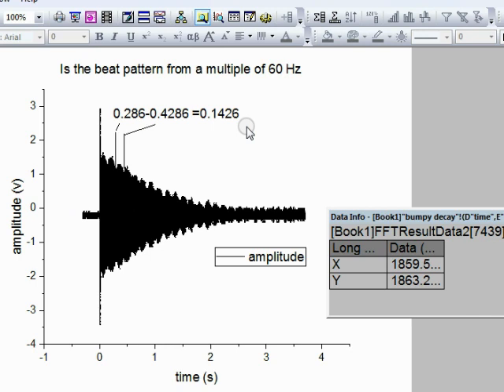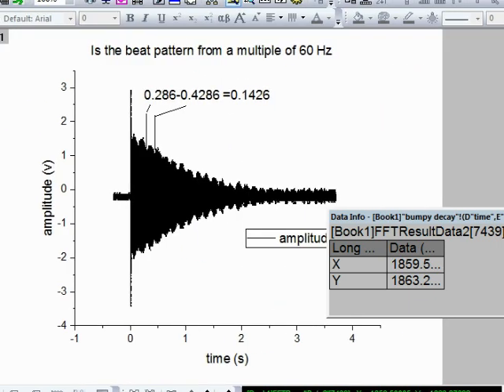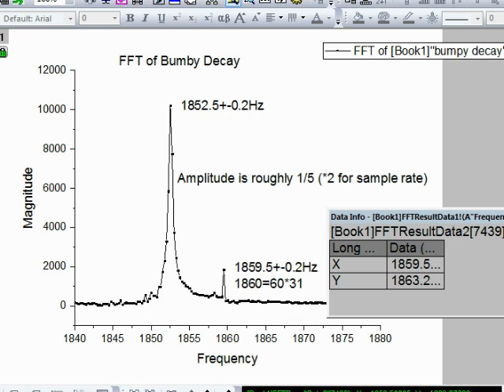That's under 10%. So for very crude, rough measurements, I think I can say that this beat pattern that you see is based on a multiple of the 60 hertz line coming in, which I didn't consequently measure. The 60 hertz can vary by a small percentage, and if I even change that by a small percentage, I may have got a different number. Although, honestly, I could have gone back to my Fourier transform and said it was off by very, very little based on the Fourier transform.